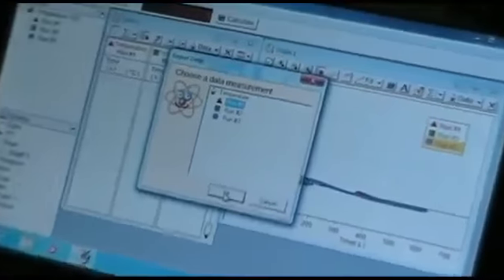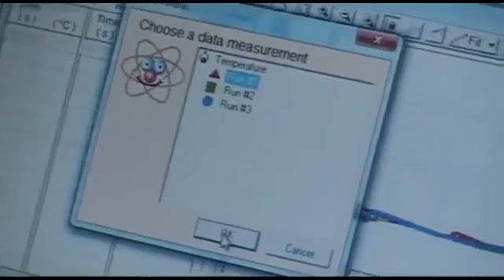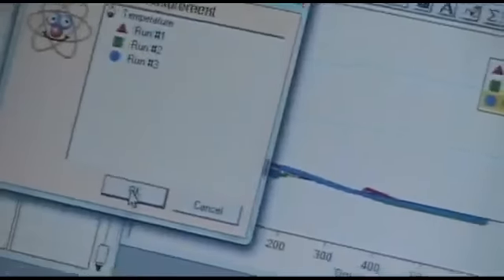And we'll collect data and analyze the data and see if there's any difference amongst the three solutions. So right now we're exporting the data so that you'll be able to generate this graph at home and then hand it in as part of your reports.